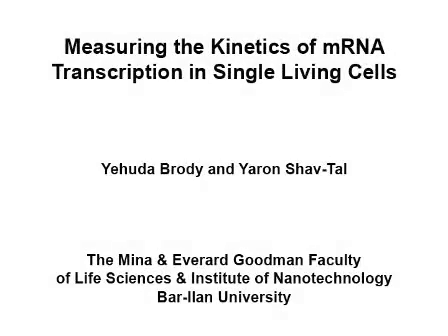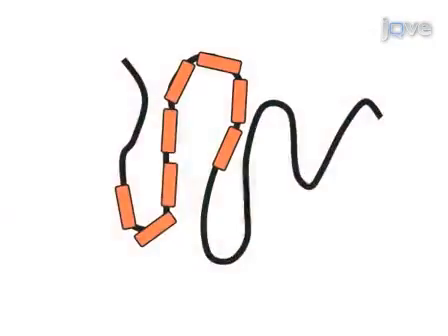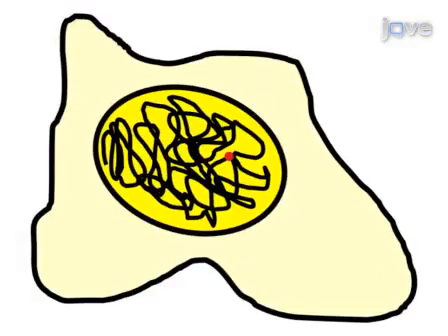The overall goal of the following experiment is to measure RNA polymerase II transcriptional dynamics in living cells as it transcribes from a specific gene in real time. In order to follow transcription on a specific gene sequence, a gene construct is stably integrated into a human cell line. This gene enters in several copies into one random site in the genome and forms a gene locus containing a tandem array of this specific gene.